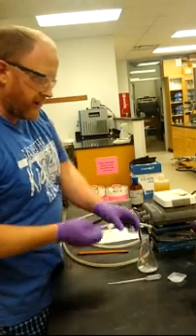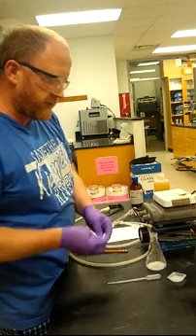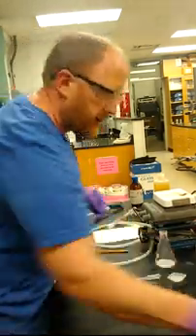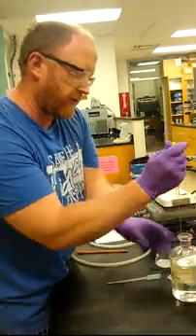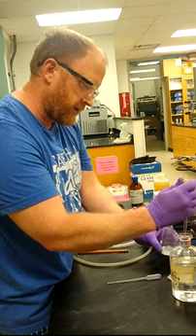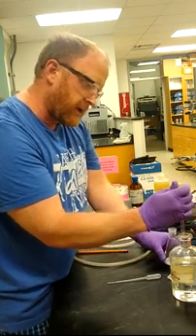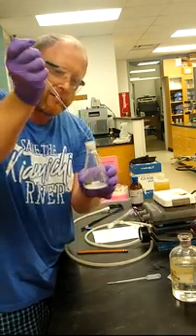After adding our acetic anhydride and our salicylic acid, I'm placing in a stir bar here and we're adding 10 drops of concentrated phosphoric acid. I might have made a poor choice of pipette because it barely sucks it up — it's so thick.